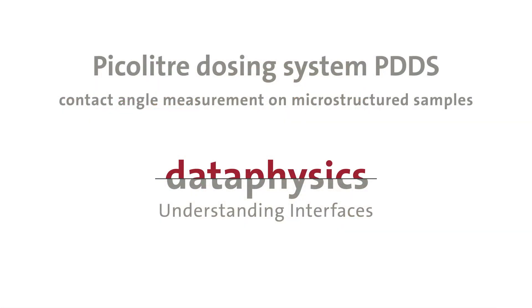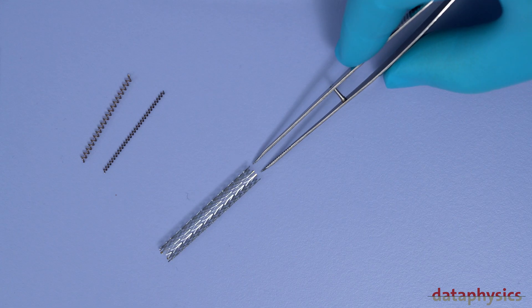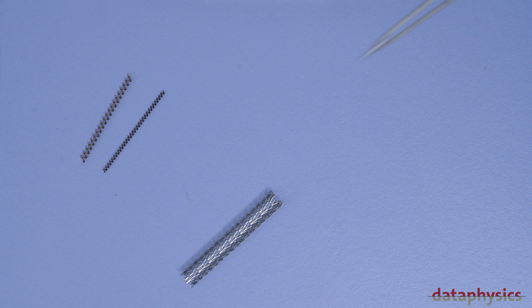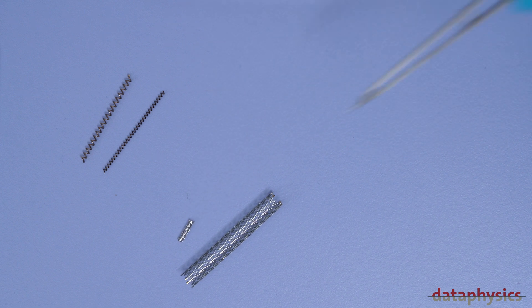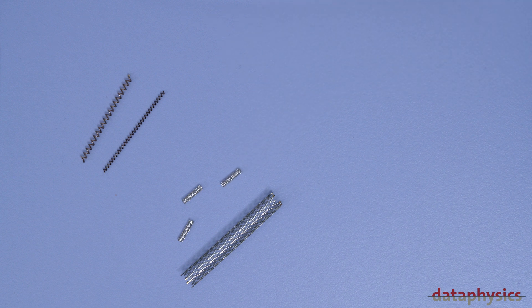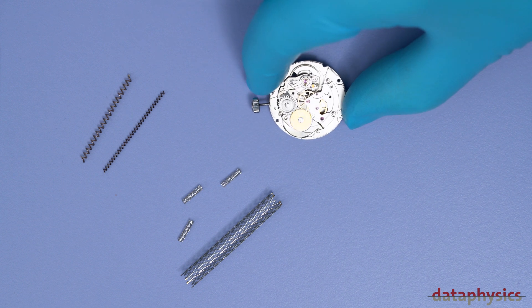The picoliter dosing system PDDS by DataPhysics Instruments is designed to measure contact angles on the smallest structures. Thus, the wetting behavior of medical implants like stents or even the smallest mechanical components can be analyzed.